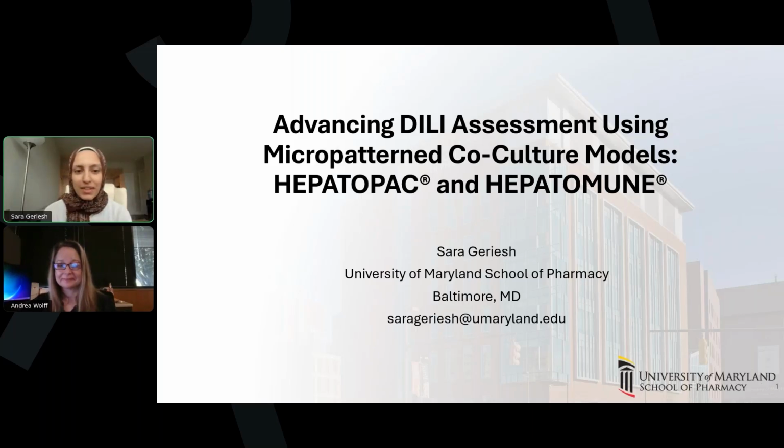So today I'll be presenting our work on drug-induced liver injury using HEPATOPAC and HEPATOMUNE models. The title of my presentation is Advancing DILI Assessment Using Micropatterned Co-culture Models, HEPATOPAC and HEPATOMUNE.